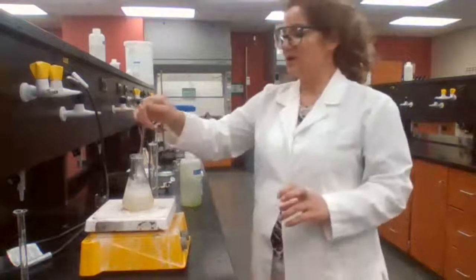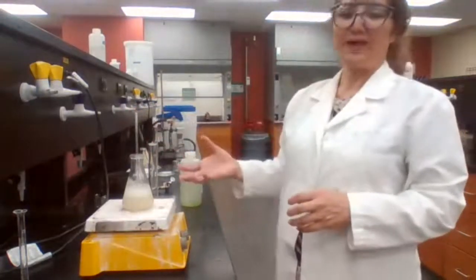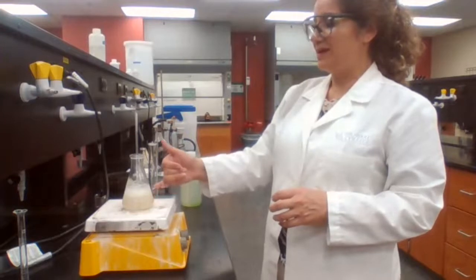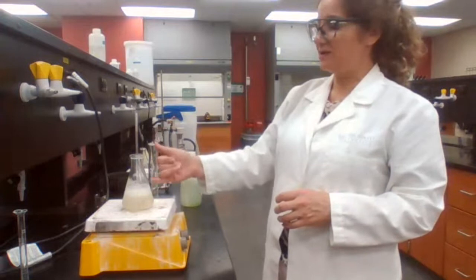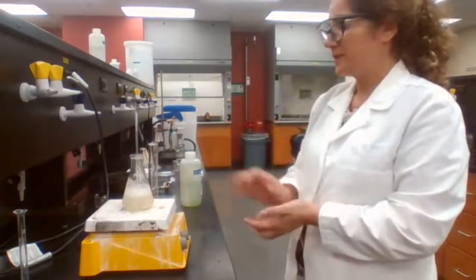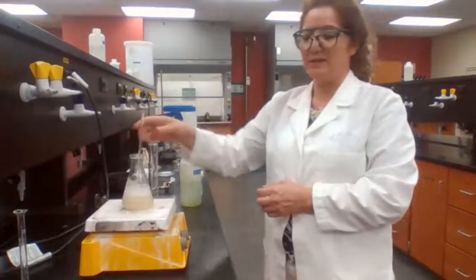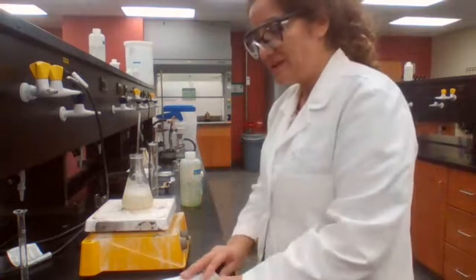Occasional stirring is going to help, but stirring is not the factor for dissolving. The temperature is, because we chose a proper recrystallization solvent whose solubility increases as the temperature increases. So when the temperature increases, the solubility increases, and the sample should dissolve. Occasional stirring is fine, but constant stirring is not necessary. So we wait until it dissolves.